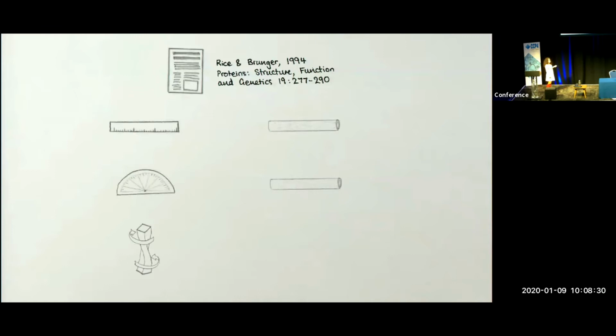But a very small number of them are allowed to vary freely. And for torsion angles, if they can vary, they are also allowed to vary freely. So the result of this is that I only have constraints in my model. I don't actually have any restraints as it stands. When you parameterize with a bond-based system, and I'll go into the details of that in a moment, I end up with about a 60% reduction in parameters for modeling a protein.